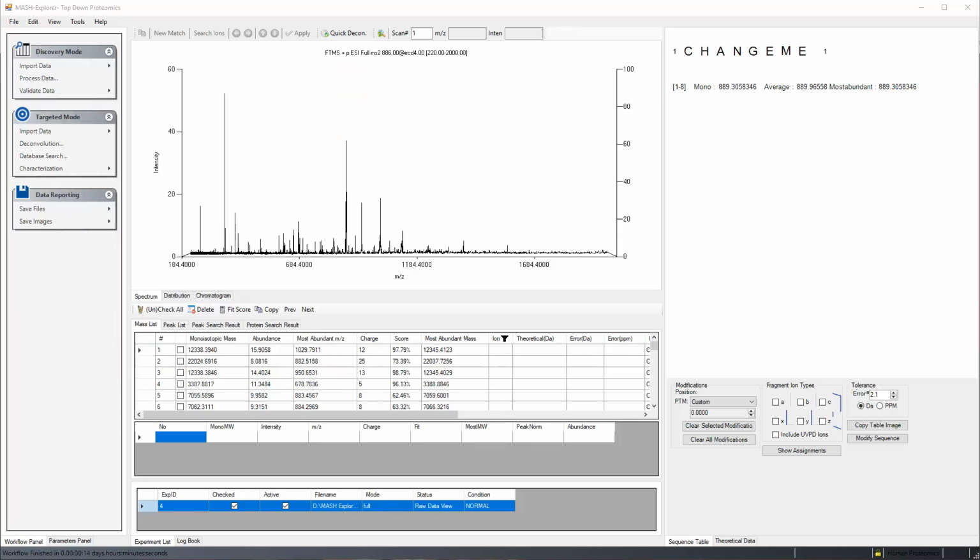Database search algorithms use fragment ion, i.e. MS2, information for protein identification. When the fragment ion selection is completed, the fragment ions can be searched against the database for protein identification. Users can choose one of the supported database search algorithms and upload the target database. Click Start to begin the database search process. The workflow manager will be initiated to handle algorithm operation.